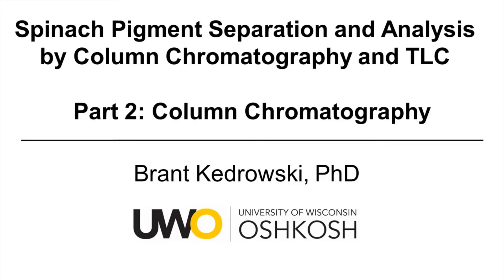Hello everyone, my name is Brant Kudrowski. This video covers an organic chemistry lab experiment that involves spinach pigment separation and analysis by column chromatography and TLC. This is part two of the experiment, Column Chromatography.